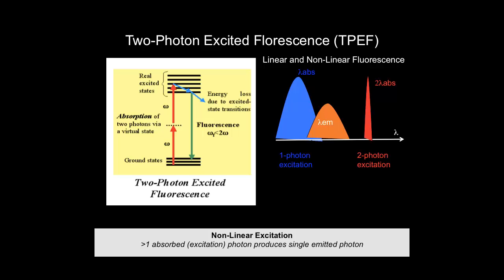I think it's important, because it was unclear to me, the difference between second harmonic generation and two-photon excited fluorescence. Two-photon doesn't require a non-centrosymmetric material, is that right? It requires non-centrosymmetric material? The two-photon does? Oh, no, I'm sorry, the second harmonic. No, the two-photon is an absorption process. It's a completely different process, a completely different set of physics, basically.